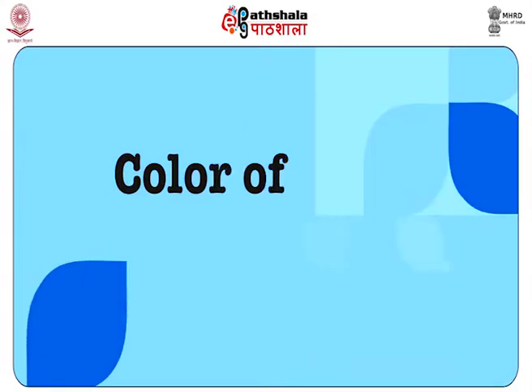First, we will talk about the color of the hair. The general color of human hair varies from black, blackish brown or reddish brown. In absence of pigmentation, they turn grey and then eventually white. Dyed or bleached hair can be detected by examining under a microscope.